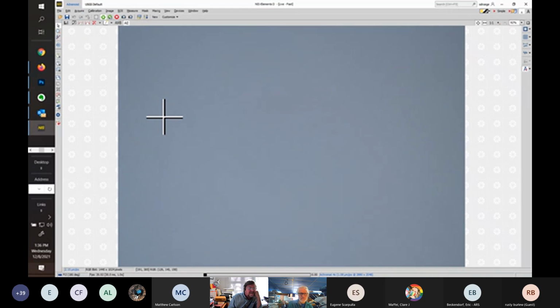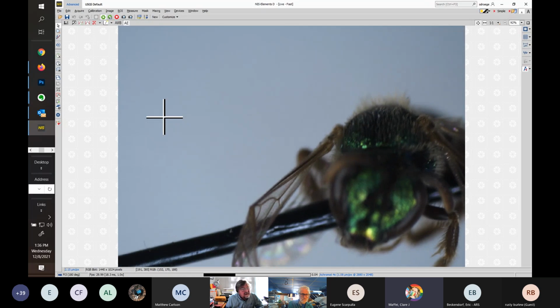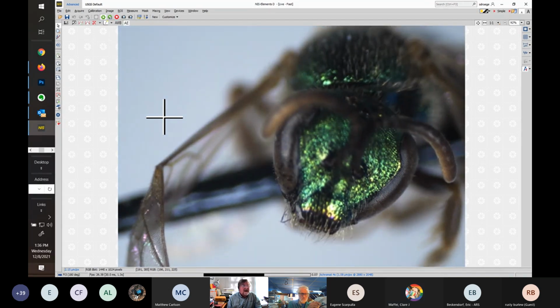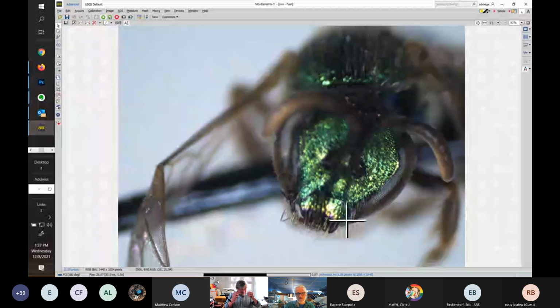That's from Hampshire County, West Virginia. So we're saying that goes down the face, not a mound that goes up the face, like if you thought of a Peponapis or something like that. No, you're talking about a lateral view. We're just saying when you're looking at right angles to the plane of the face, one of the characteristics that's useful is how far this clypeus projects out into space. It's not so much the length of the head; it's the length of the clypeus itself. And a measure of that is the proportion that projects below an imaginary line that runs between the bases of the eyes.